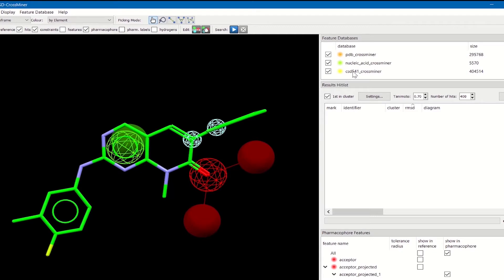You also notice that the three subsets are different colors. This is really useful when during the search you are using all these different structured databases and you want to distinguish between a hit that is coming from the PDB versus one coming from the CSD, for example.